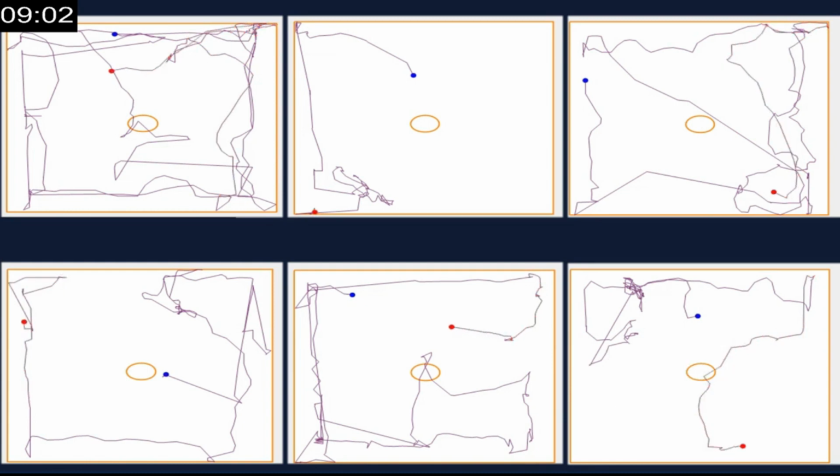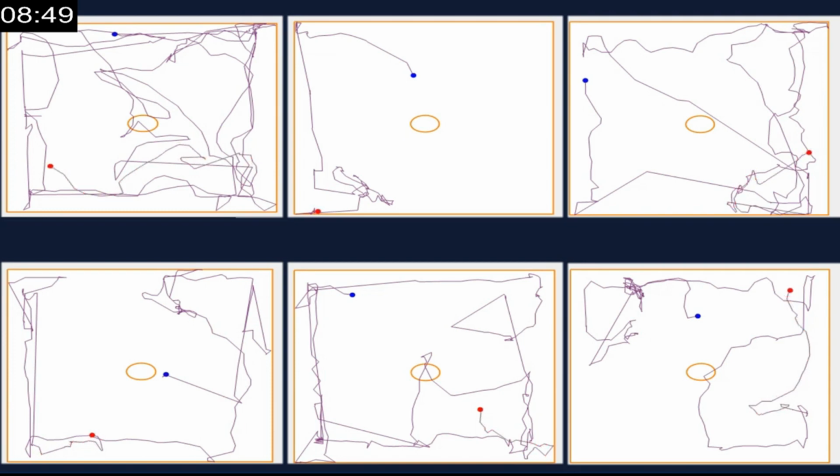It should be around 1000 lux at the center of the box where we are putting the feed platform, and at the sides of the box it should be around 100 lux illumination.